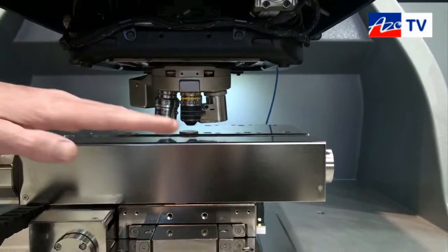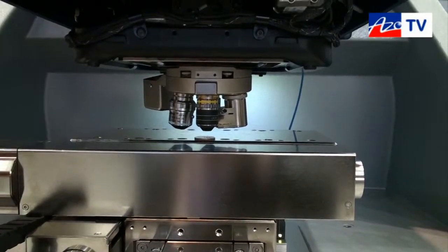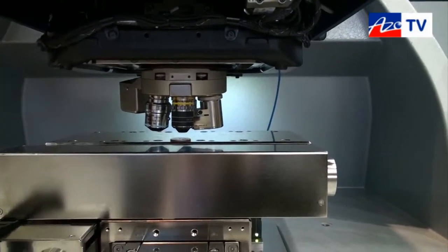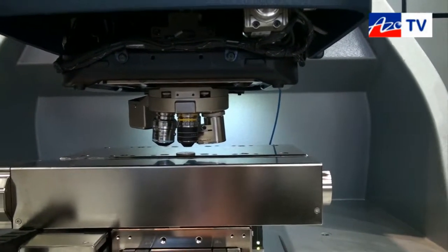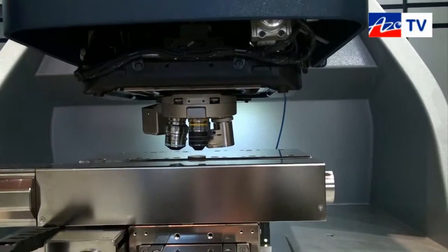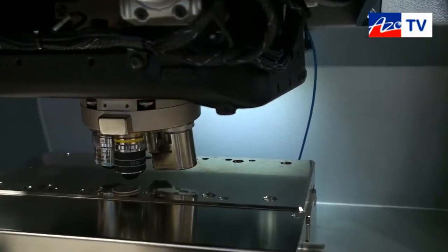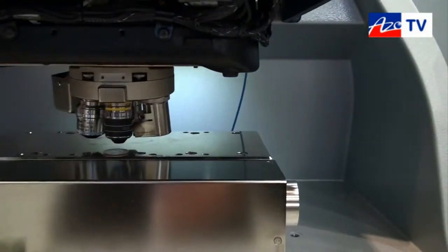The measurement is made by scanning the objective through focus. When the sample surface is in focus, we get the most intense fringes back at the camera. Each pixel in the camera records what Z height yielded the greatest intensity of the reflection, and in this way we build a three-dimensional map of the sample surface.